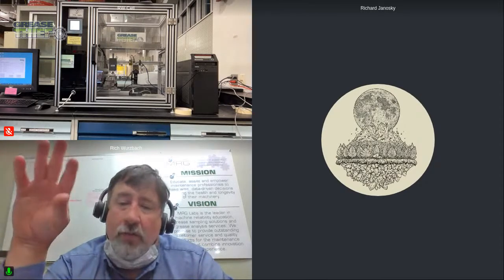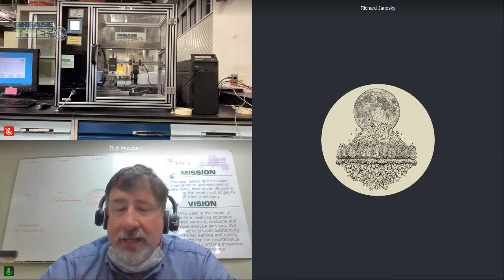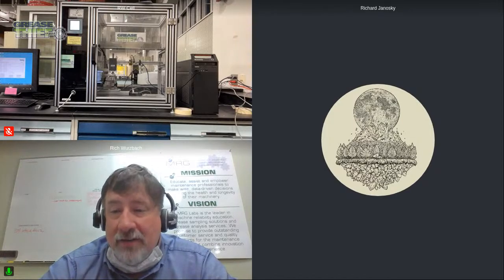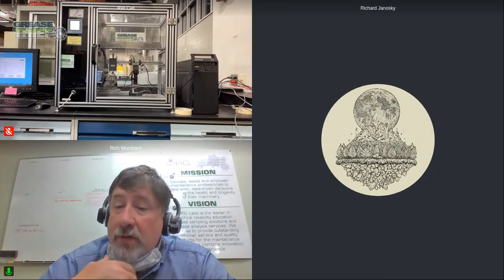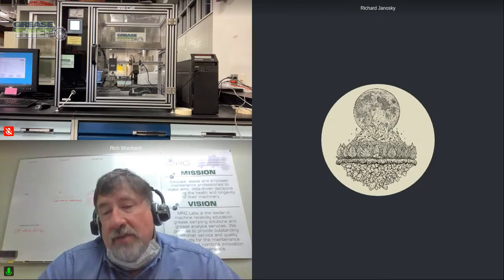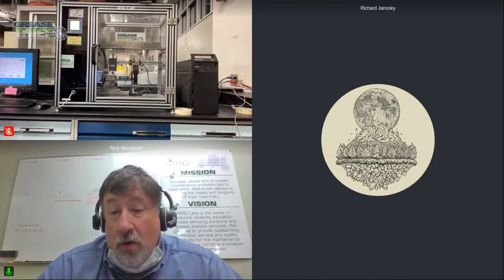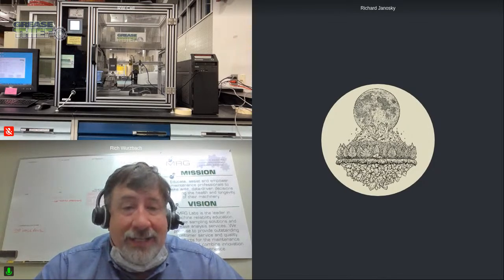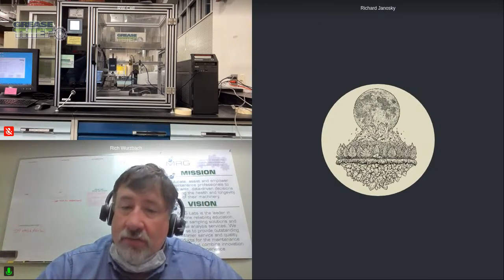And so there we adjusted it to plus 120, and I think it was less than 70 or less than 65 or something like that. It just had to be developed over time. So there are no real absolutes when you look at this, because greases behave differently. But the nice thing about this particular technique is you're always referencing back to the new grease, the grease in the condition when you first put it into the machine, and you're looking for changes over time.